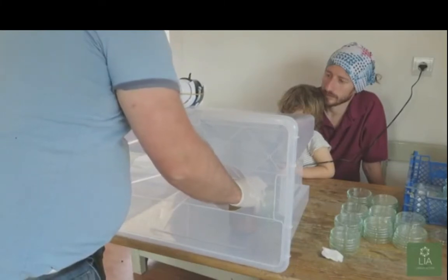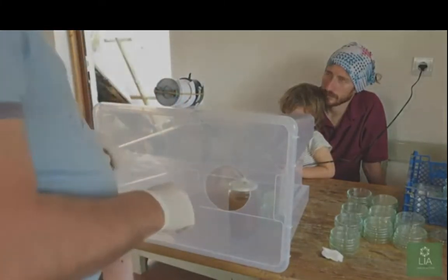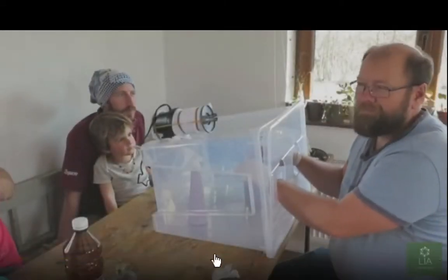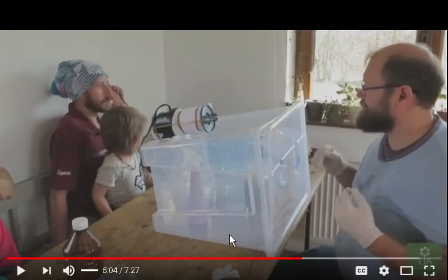I have not seen this video. Okay. I kind of like it. I mean, it's pretty close to an idea that, as far as transferring fluid into the Petri dishes, what I would do. Now, supposedly all the air is going out of those holes, because that's the only place it can go. So there's no airflow into the holes, and because he's wiped down the sides, it should be a fairly sterile environment. That's interesting.